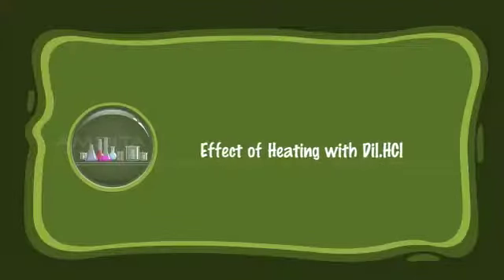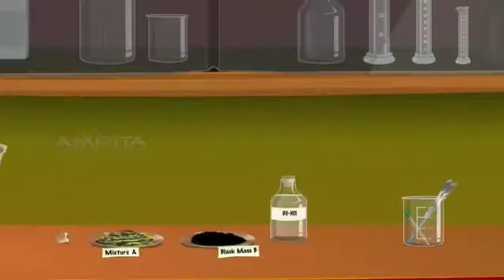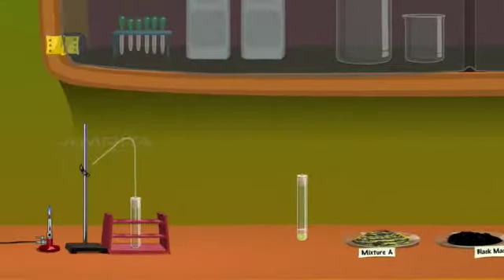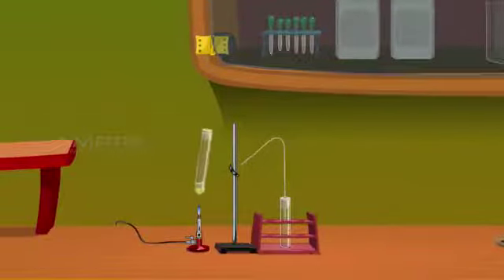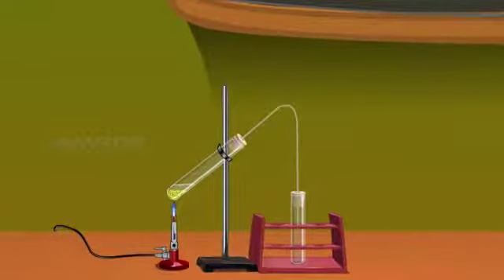Effect of heating with dilute HCl. Take a small quantity of mixture A in a test tube. Add a few drops of dilute HCl into it. Cork the test tube. Connect the test tube to another test tube with a bent tube. Heat the contents of the test tube gently. A colorless, odorless gas evolves.